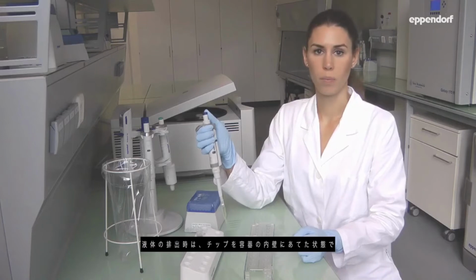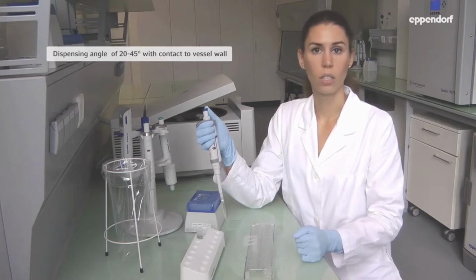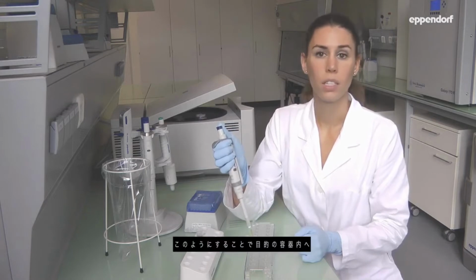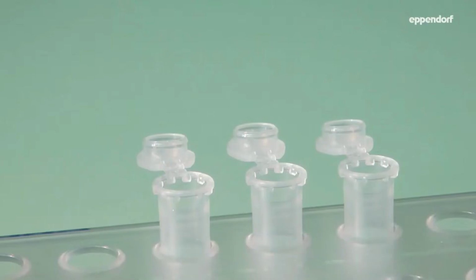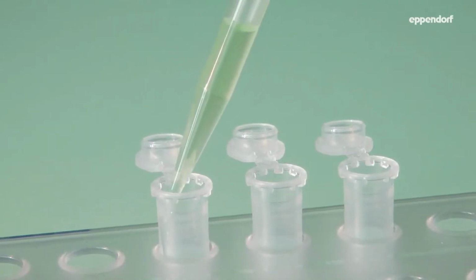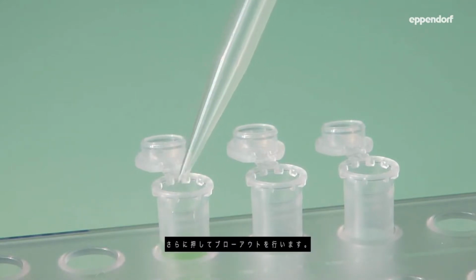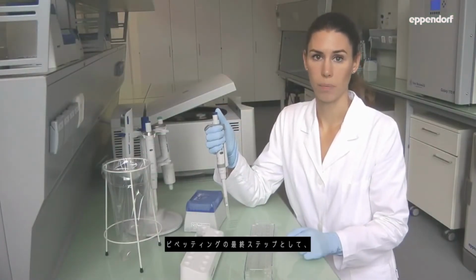When dispensing liquid, the angle of the pipette should be between 20 and 45 degrees, whilst the tip should stay in contact with the vessel wall. This guarantees optimal flow out of the liquid into the target vessel. Press the control button down to the first stop. Then perform the blowout by pressing further down to the second stop. This ensures that the tip is emptied completely.